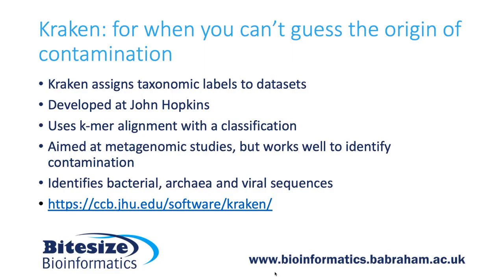So far I've been talking about FastQ Screen and how in most circumstances you can probably predict what the source of contamination is going to be in your sample. So that could be something else you're currently working on in the lab, or maybe some organism somebody else is working on in your lab, maybe some sort of bacterial species you've been using to create your library, or something else that's been run on the sequencer. However, whatever it is, you can probably have a reasonable guess at the source of likely contamination. And that's all well and good in most instances.